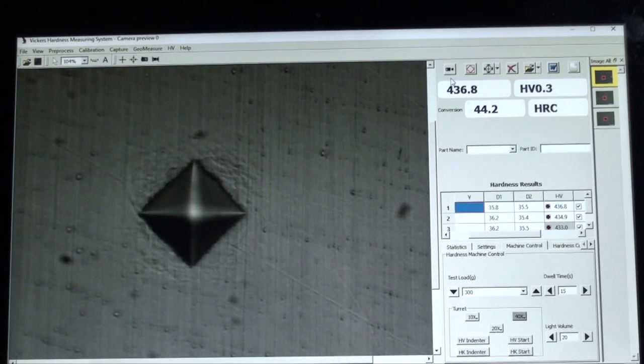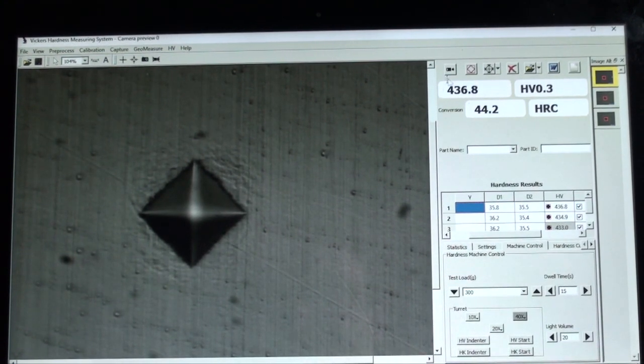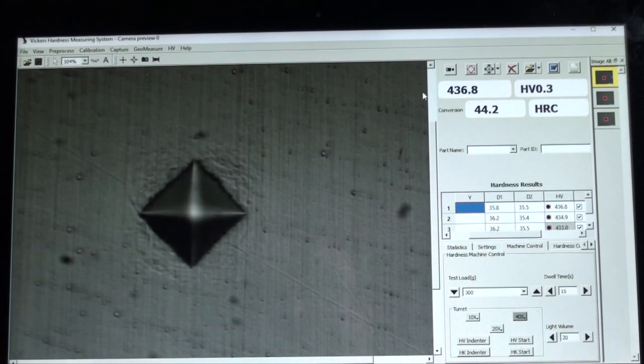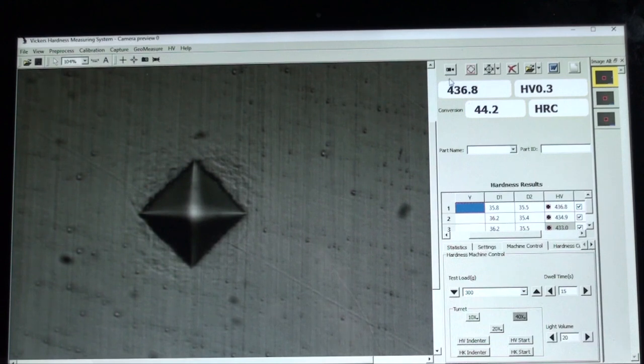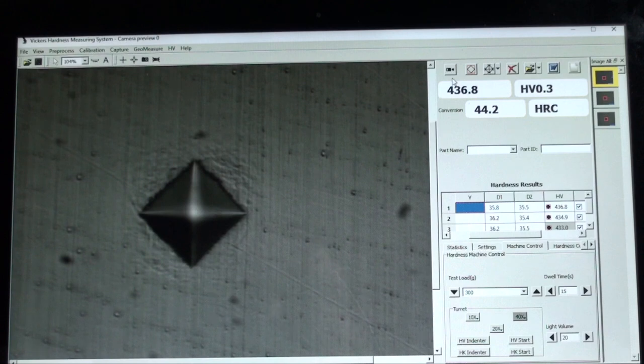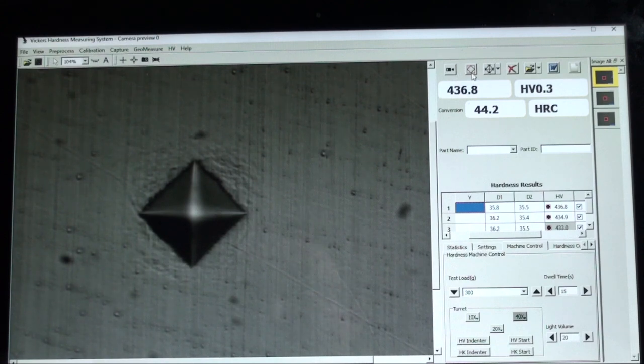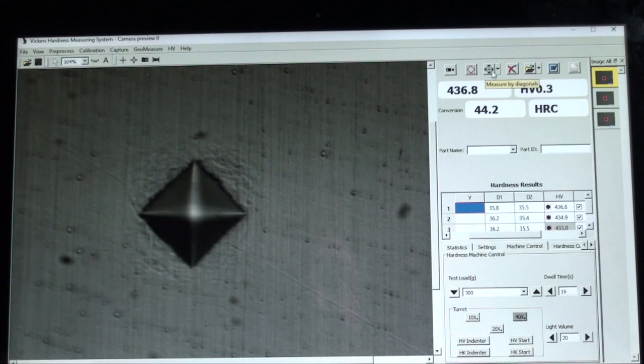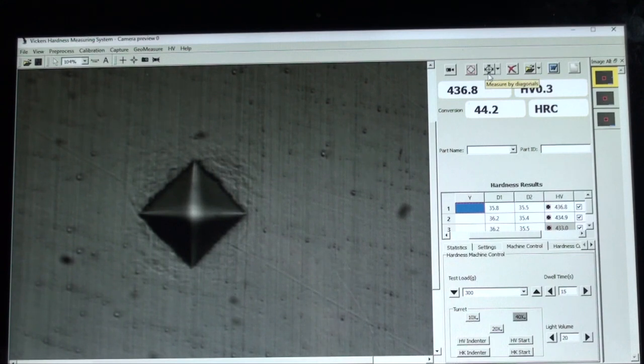Let's review more of the digital interface. On the top right we have refresh, then auto measure, then measure by diagonals. We can delete the last reading.